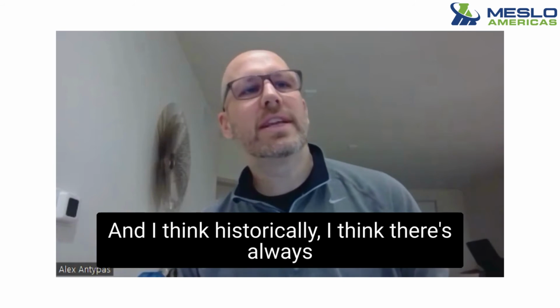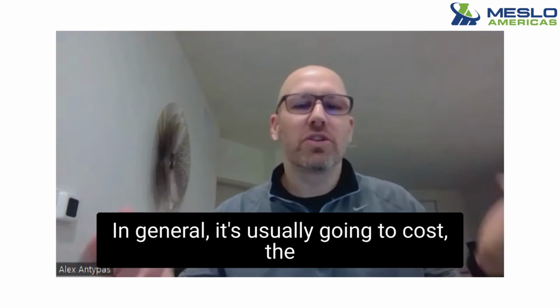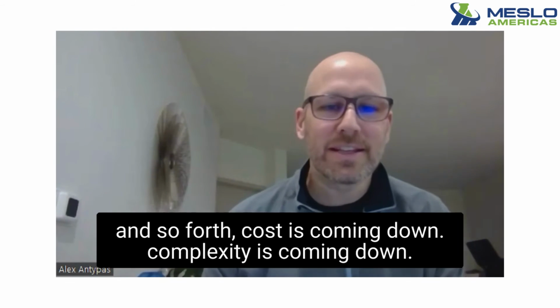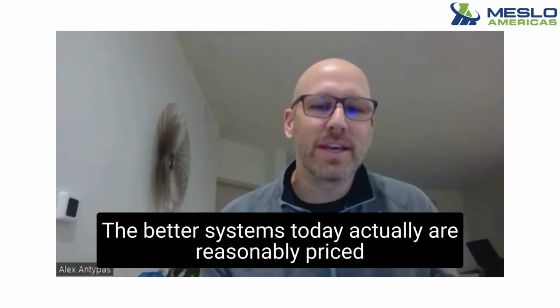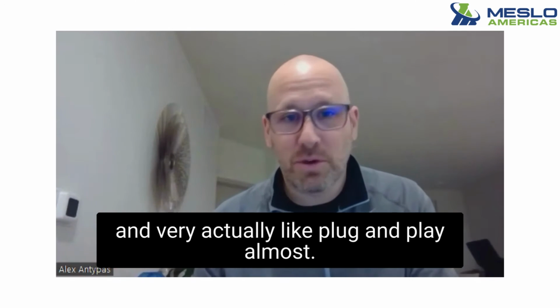Sure. And I think historically, there have always been two key barriers to automation in general. It's usually been cost and complexity. And as we make more technological advances and so forth, cost is coming down and complexity is coming down. And the better systems today are reasonably priced and almost plug and play.